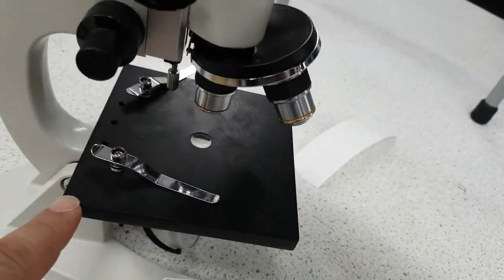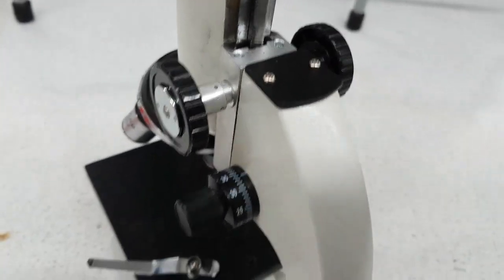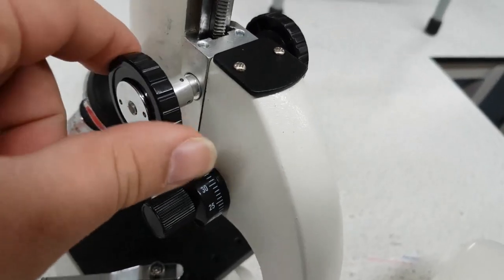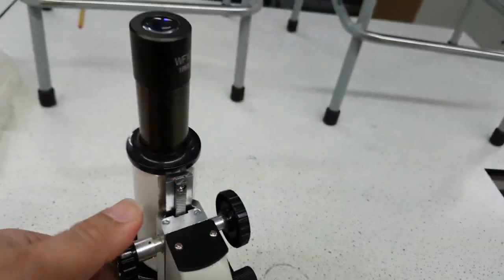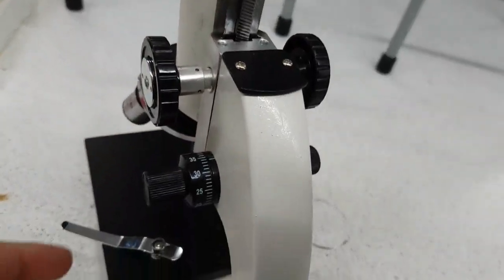This is the stage and you have two pairs of knobs. The first one is the coarse knobs, which basically causes all of this to move up and down by quite a lot.